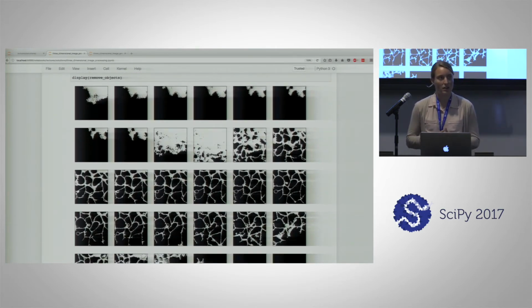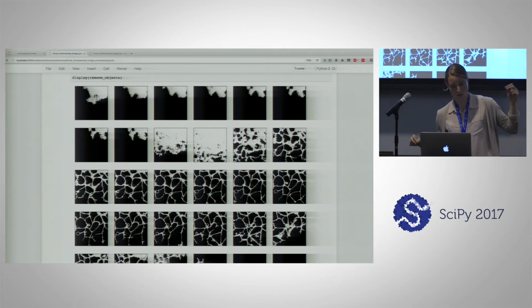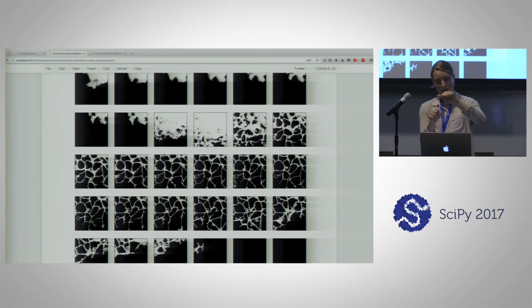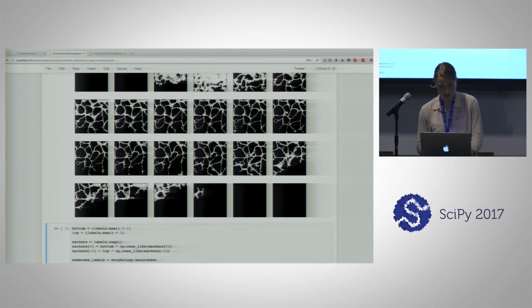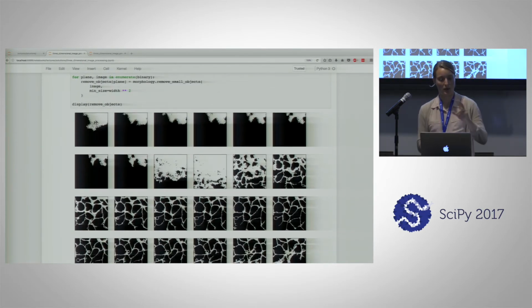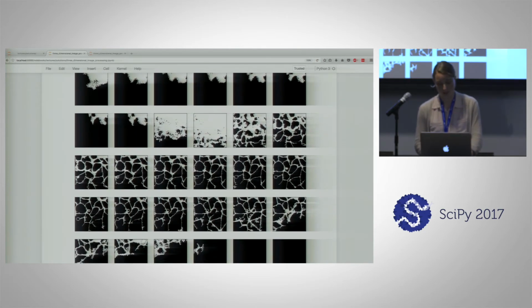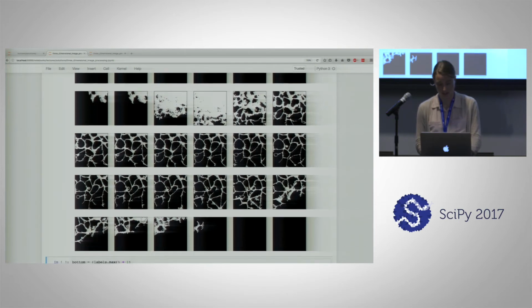So we've cleaned it up at the expense of losing a few of those membrane walls, but our seeded image, when we apply the watershed, ideally will meet where that wall once stood. There is some noise in these upper and lower planes that we would like to ignore, but I don't have a good technique just yet for cleaning that up.